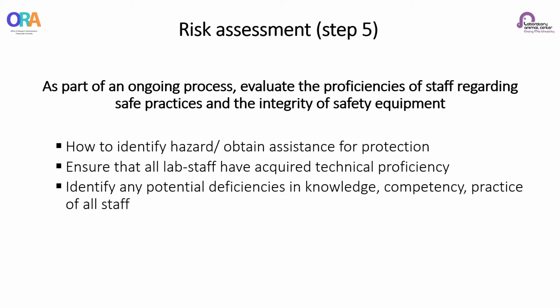An assessment should identify any potential deficiencies in the knowledge, competency, and practices of the laboratory workers. Training, experience, knowledge of the agent and consideration of hazards, good habits, caution, attentiveness, and concern for the health of co-workers are prerequisites for laboratory staff in order to reduce the risk associated with work with hazardous agents.